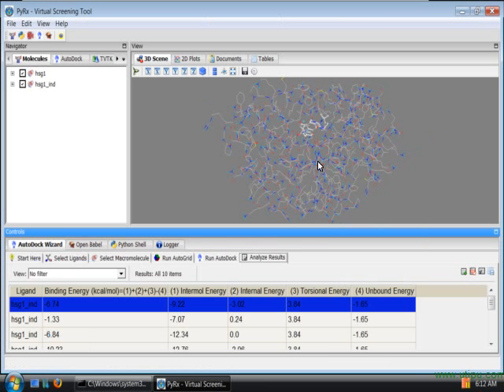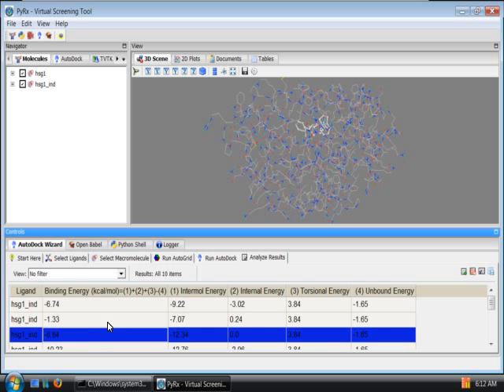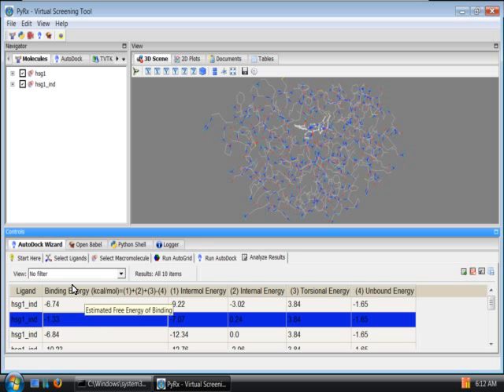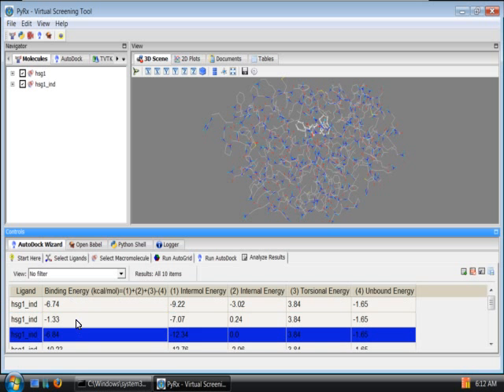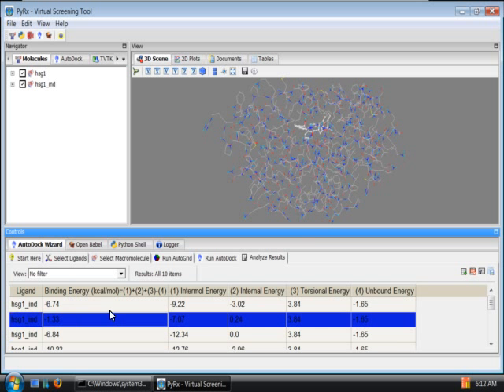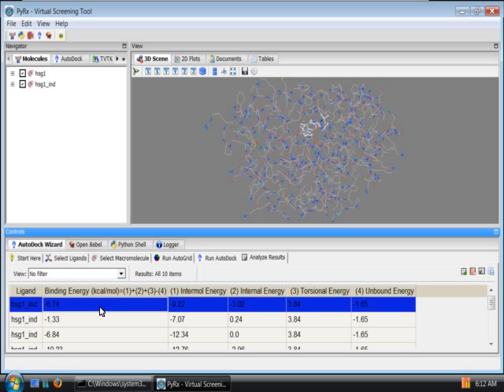This is the final page which is called Analyze Results and here we can see the table of the dock results with the binding energies. When you select a row from this table the appropriate conformation is updated.